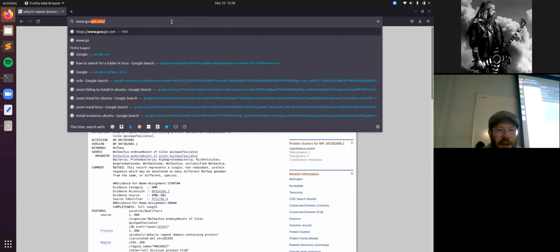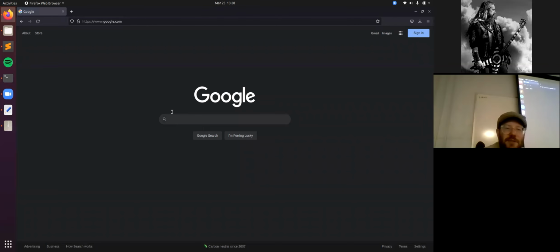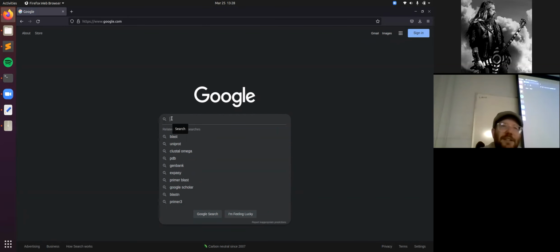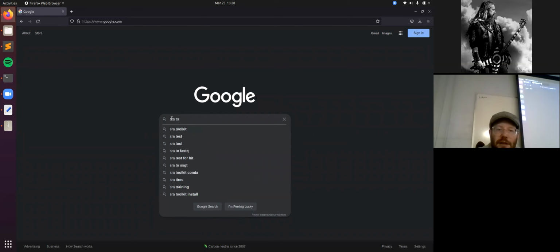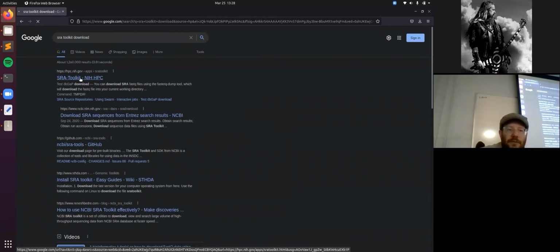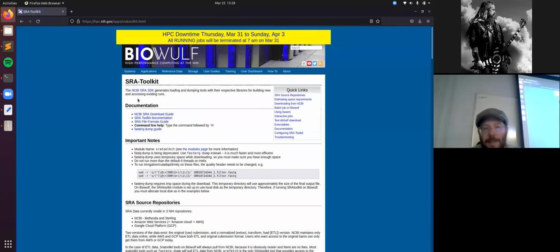Do you have any tools, Cassidy, that you use for Bash or Linux? He wants me to just download something to demonstrate. Depending on what you're trying to download, we use the SRA toolkit, and you can access and get the FASTA files from the Sequence Read Archive. So this is a Linux thing? Well, it's NCBI, but it's a command line tool. Okay. Let's see.